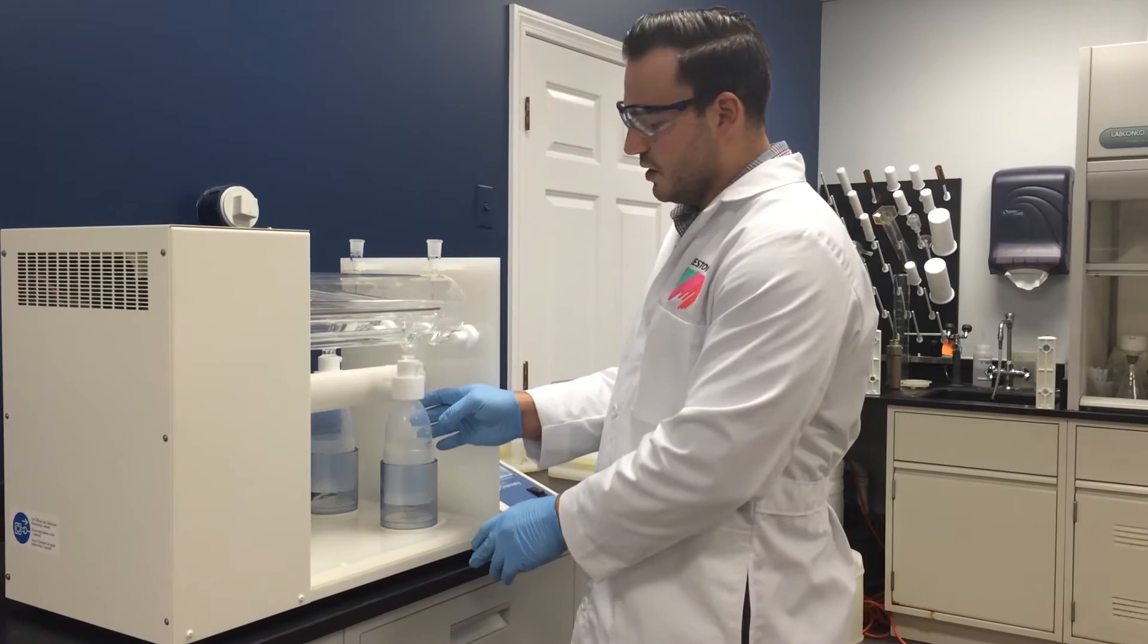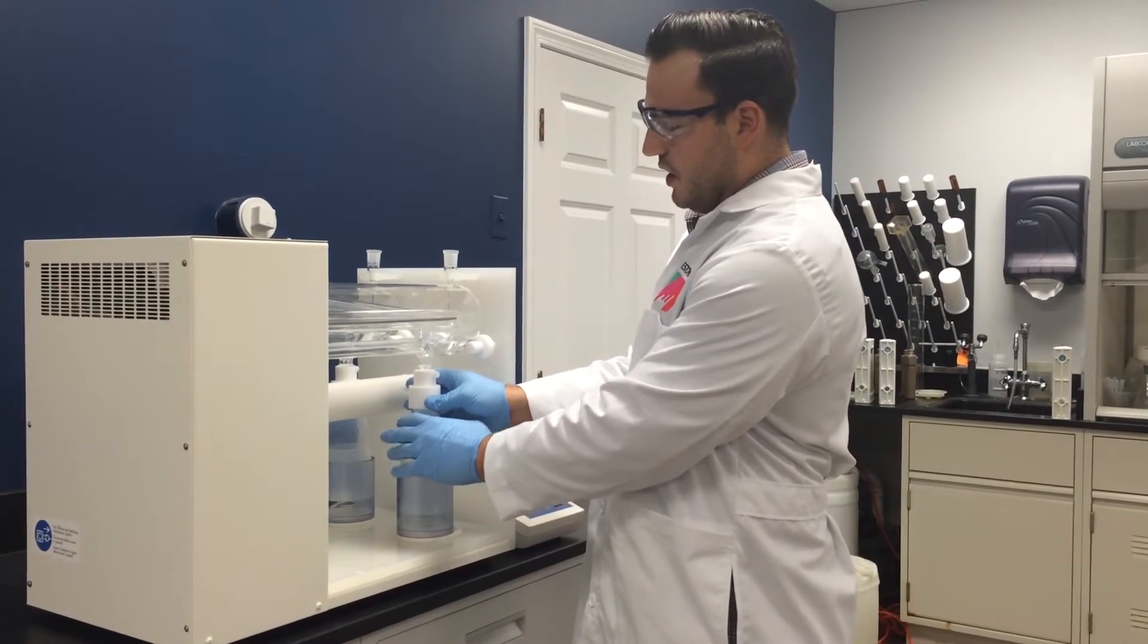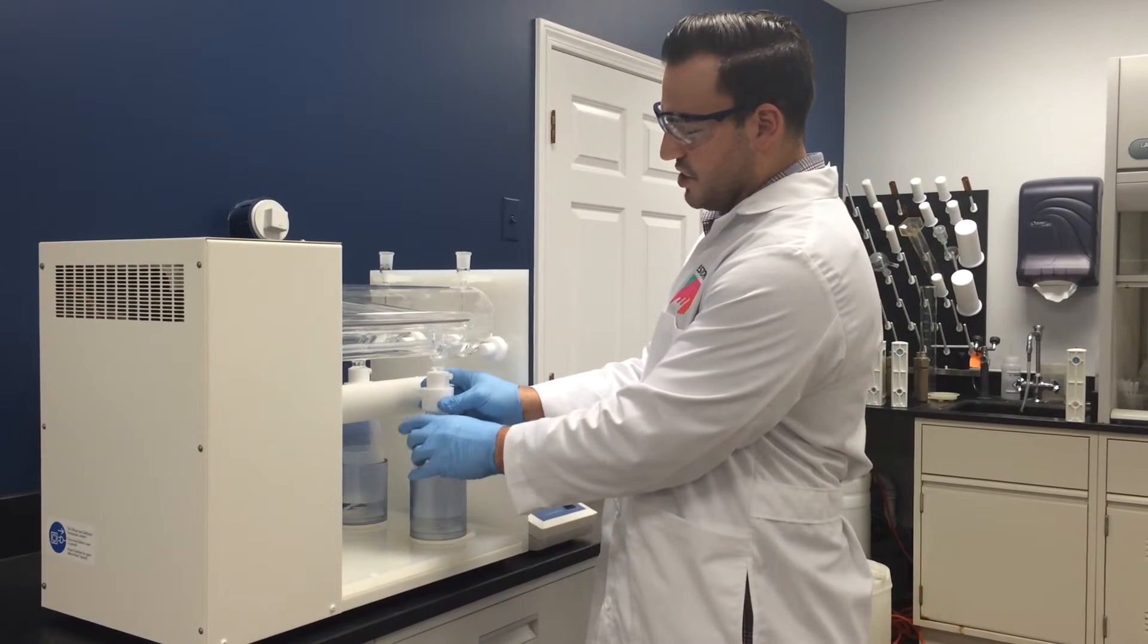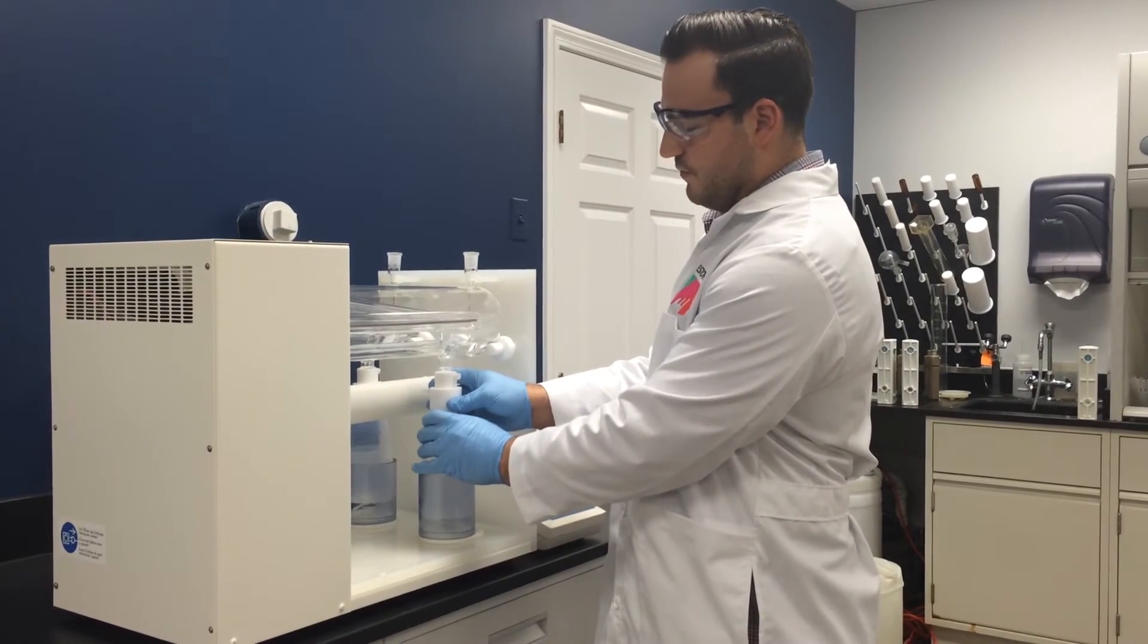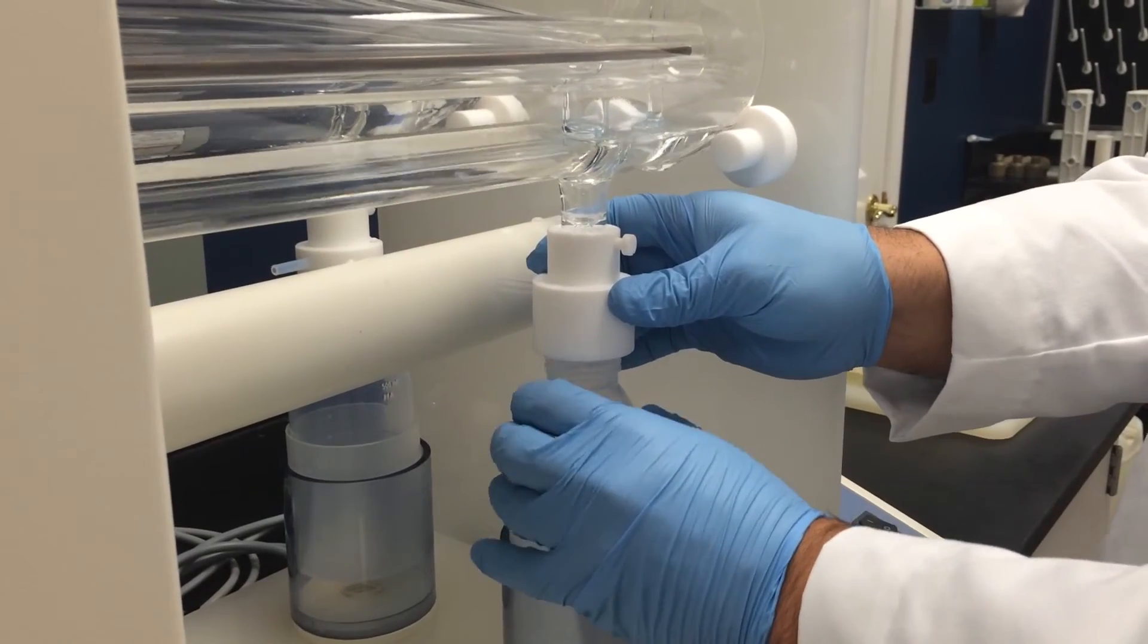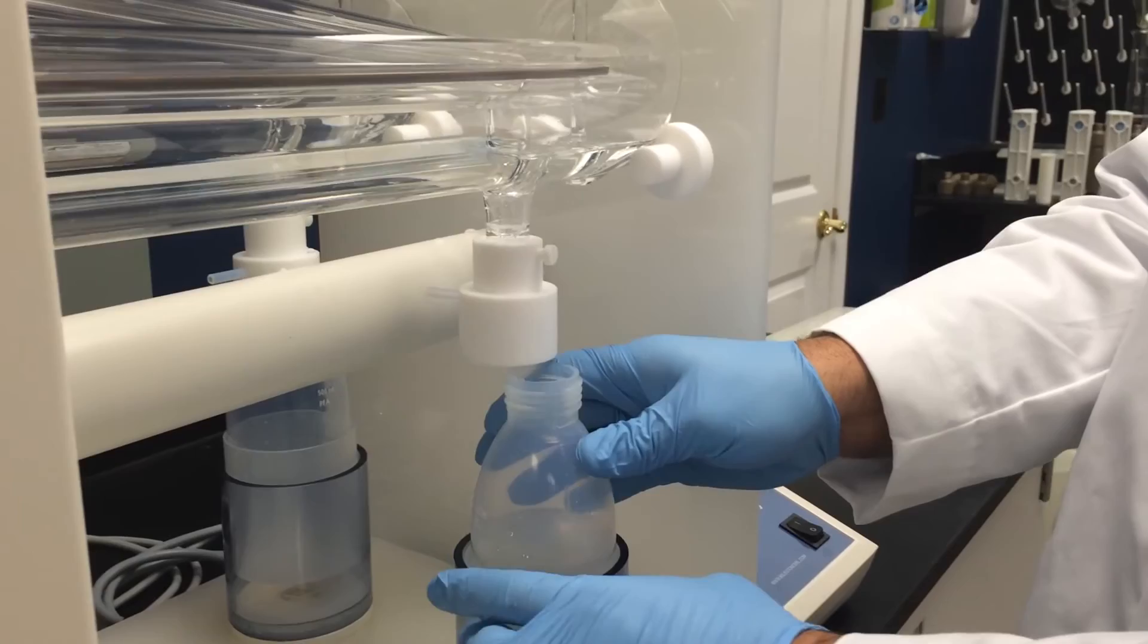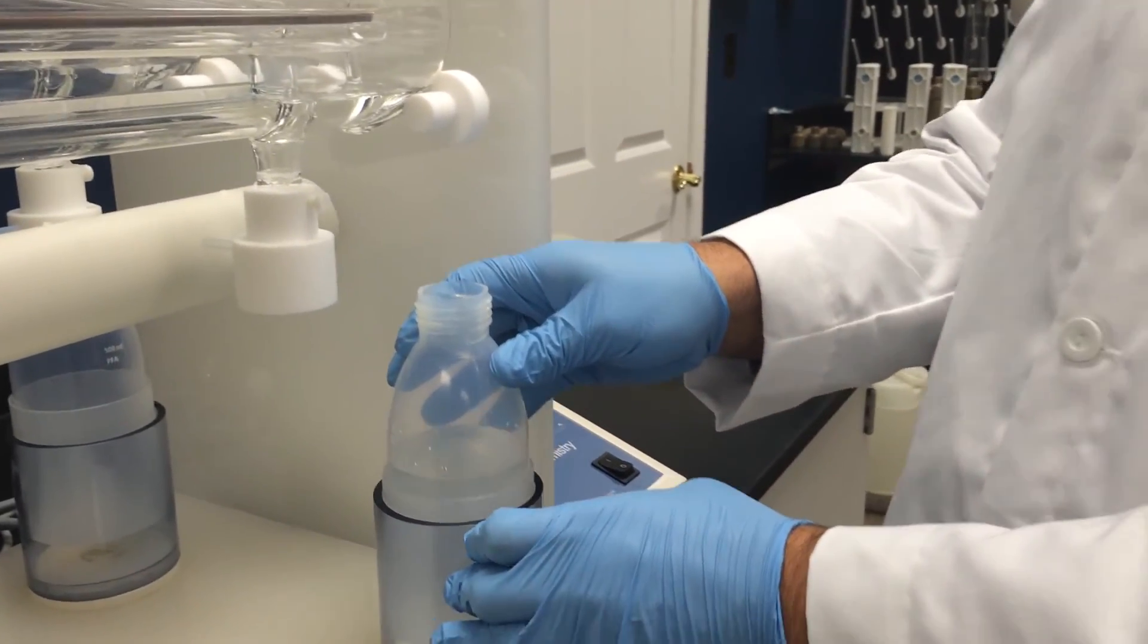To remove the collection flask turn it clockwise while stabilizing the teflon connection until the distillation flask is completely separated. Press down and slide the collection flask out of the system.